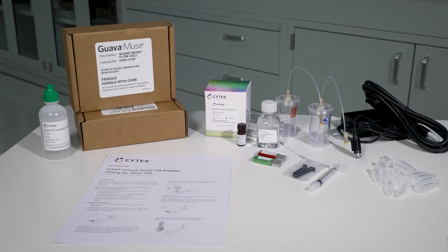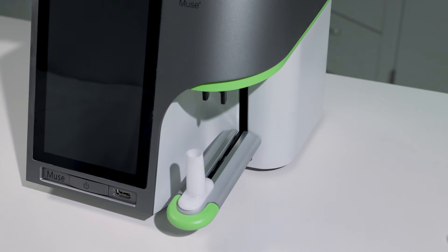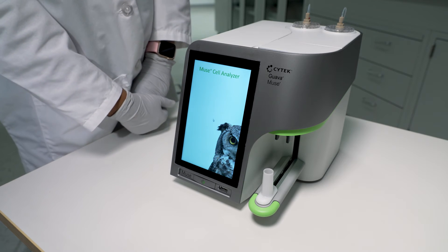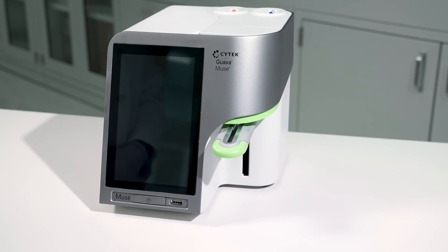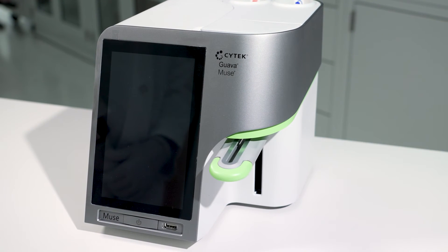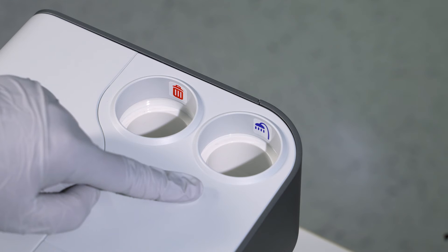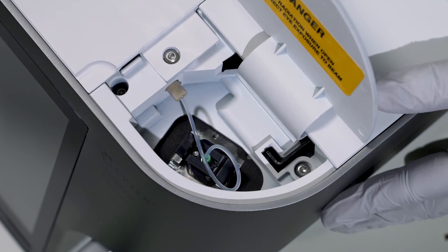Now that you've identified all the components shipped with the Guava Muse, let's take a closer look at the instrument. The loader arm has a vial holder where you will place your sample when it is in the down position. Raising the loader arm to the up position allows your sample to be analyzed. When you receive your new instrument, the loader arm should be locked in the up position and will drop once the instrument is turned on. The on button is located at the front of the instrument. Do not switch your instrument on just yet — you will need to complete flow cell installation before powering up. The waste and cleaning bottles will be installed in the receptacles, and at the top of the instrument is a chamber where you will place the flow cell. Installation of the flow cell is covered in Chapter 2.